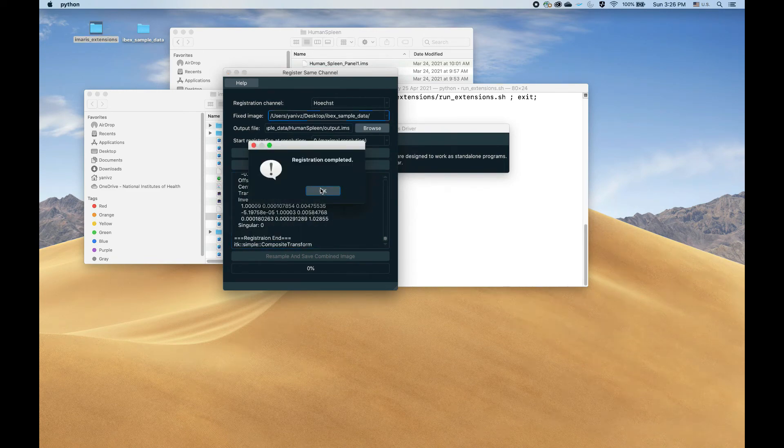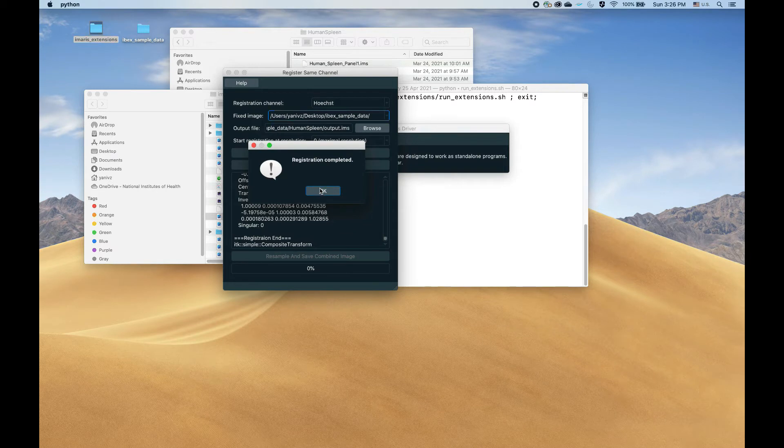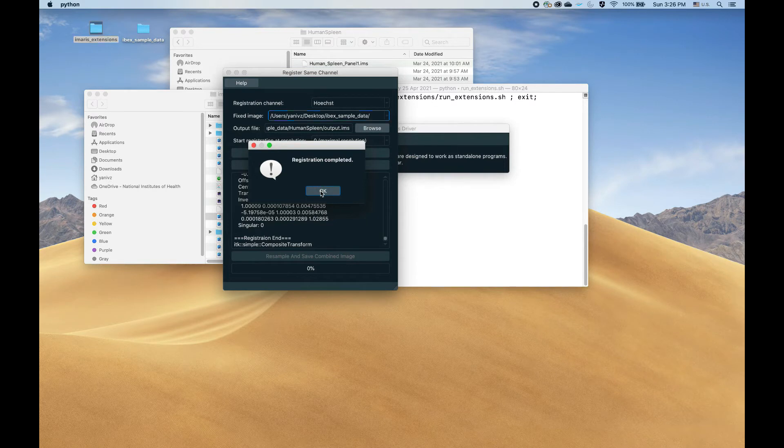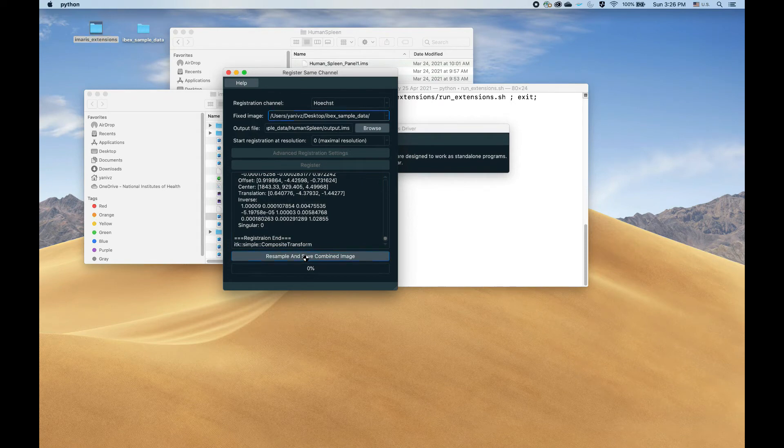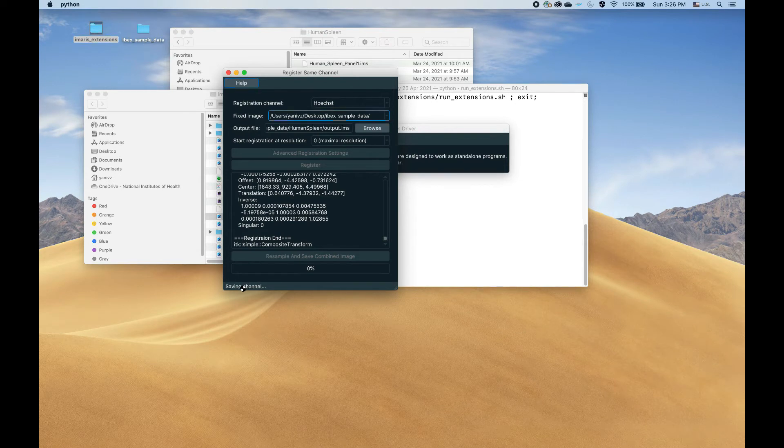Okay, so registration is finally completed. The pop-up notifying us of this has come up. Let's press OK, and now we need to resample and save the combined image. That will take a while too. Let's start the process, and you can see the progress happening here.